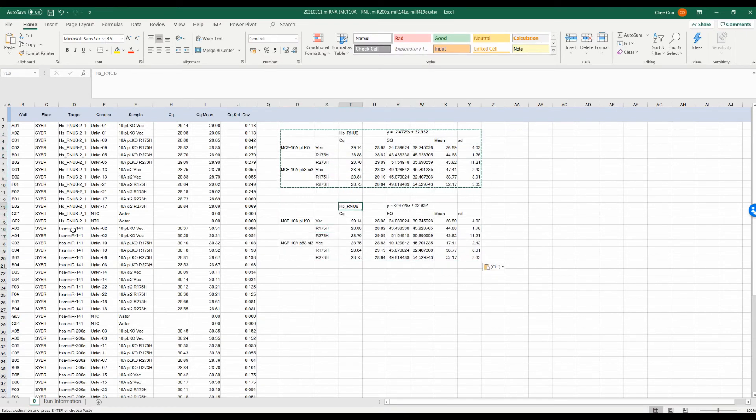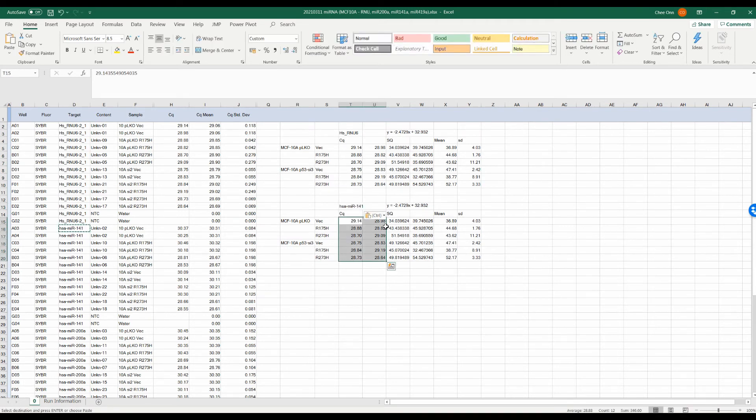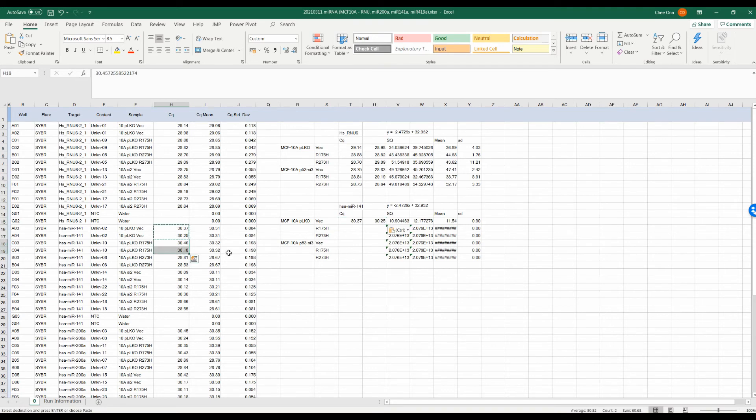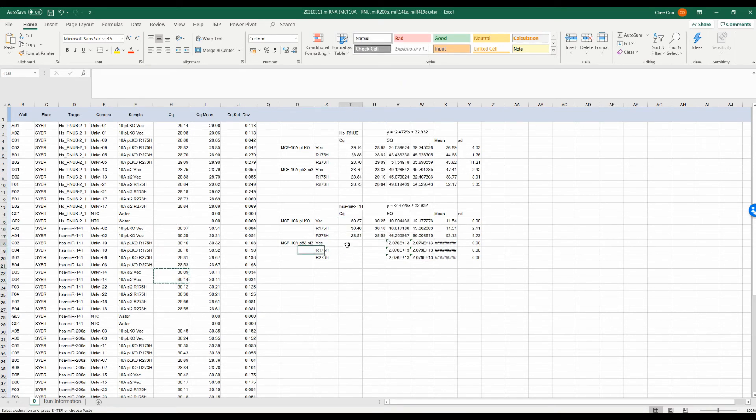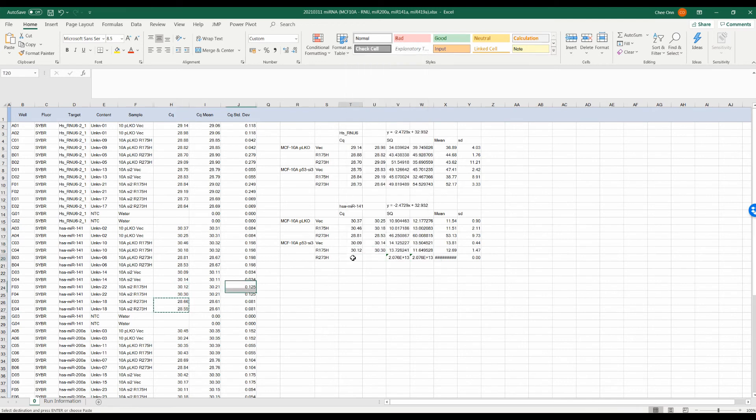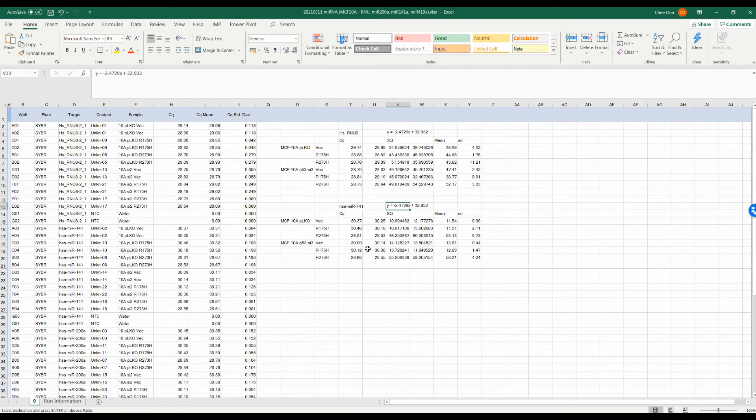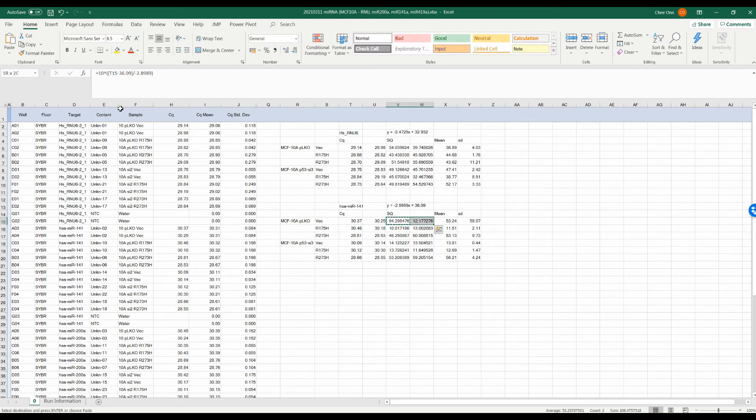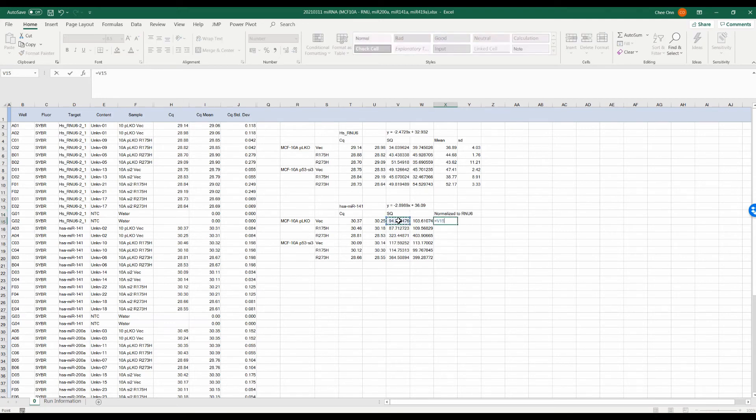Next, we will do the same for the target genes that we are interested in. We will first convert the CQ to SQ. Then, we will normalize the SQ against the SQ of the RNU6, which is our housekeeping gene. This will help us to correct the variations in the concentration of the cDNA template which might occur during our cDNA conversion and dilution despite using the same amount of microRNA input for our reaction.